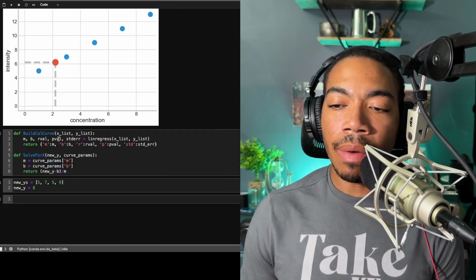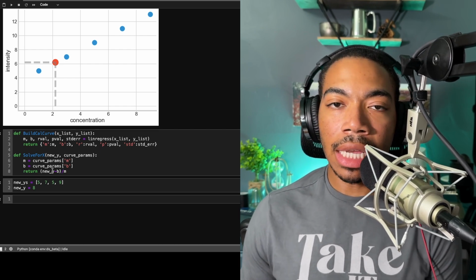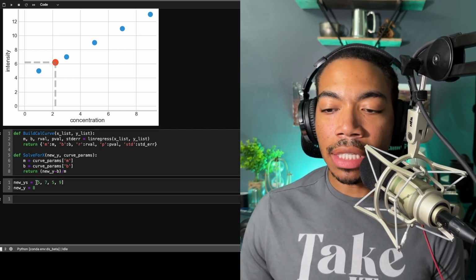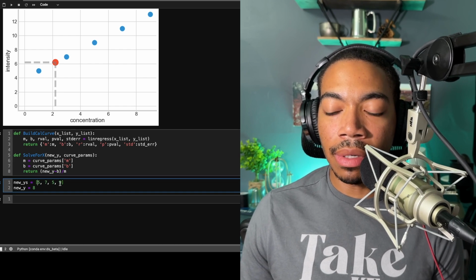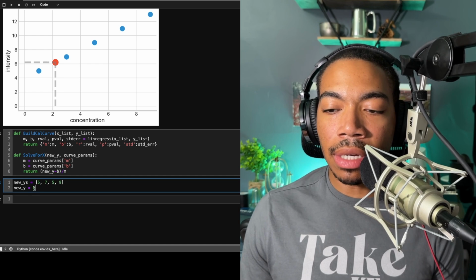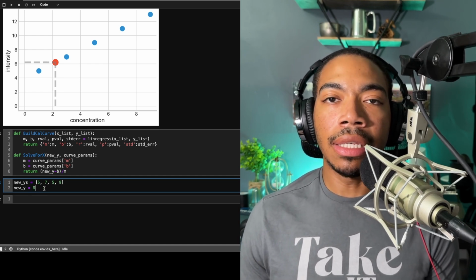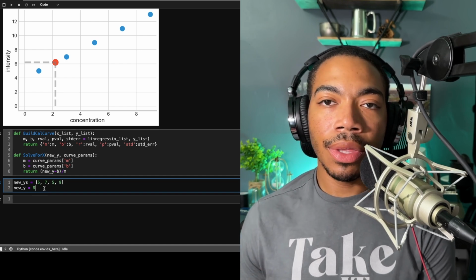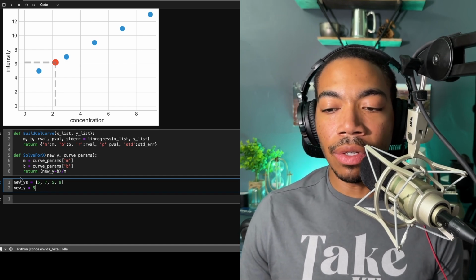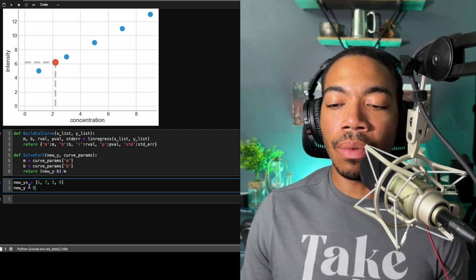So now in this video, I want to demonstrate how we can modify solve for X to not just take in a list. And so in this case, if I have new Y's, a list of Y values, maybe this represents 4 samples, or a single value, whereas now an integer, our method can discern the difference and then still either return a list of new X concentrations or a single value for our new Y sample.